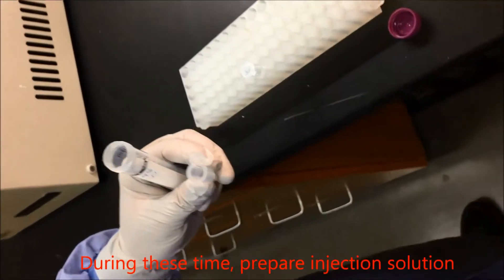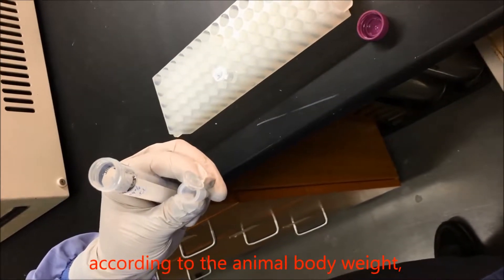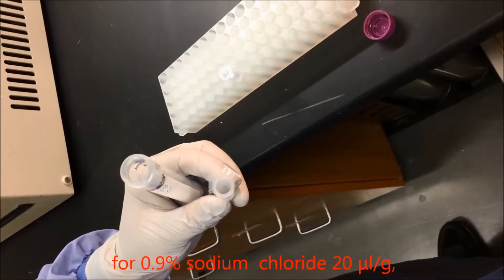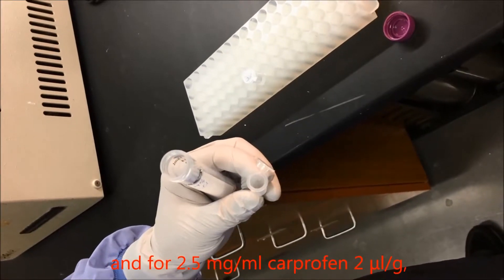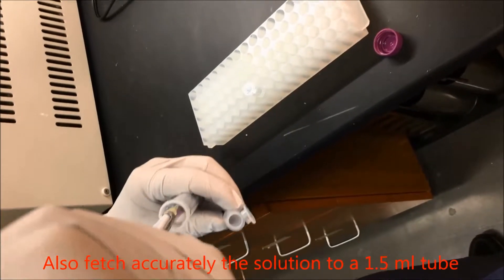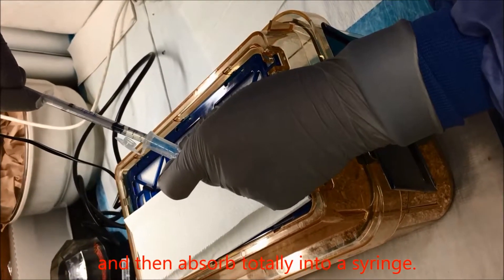During this time, prepare injection solution according to the animal body weight: 0.9% sodium chloride at 20 microliter per gram, and 2.5 milligram per milliliter carprofen at 2 microliter per gram (dose is 5 milligram per kilogram). Accurately fetch the solution into a 1.5 milliliter tube, then absorb it entirely into a syringe.